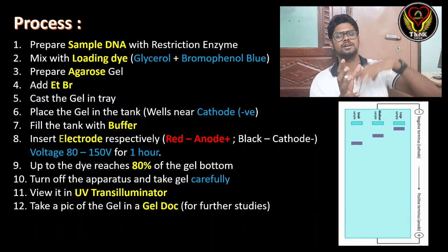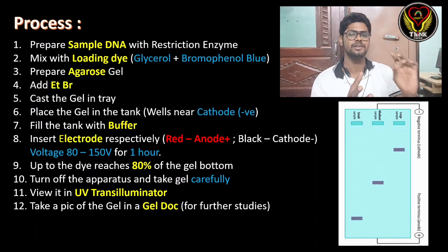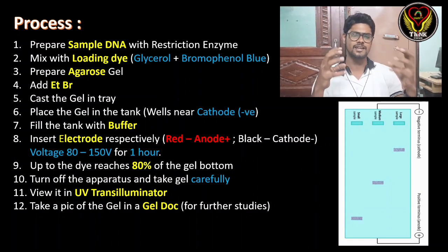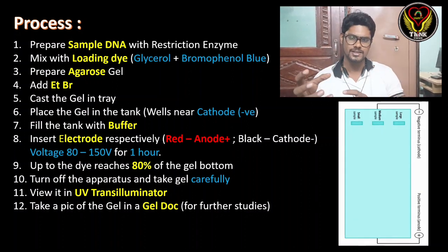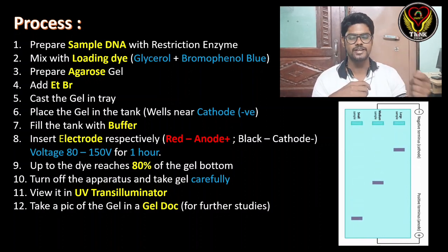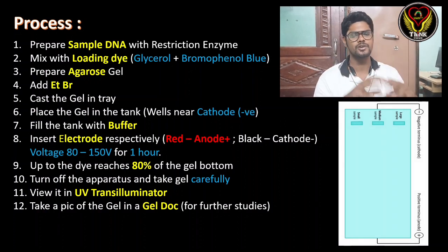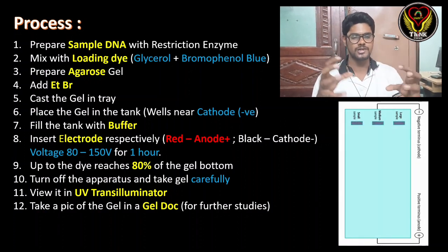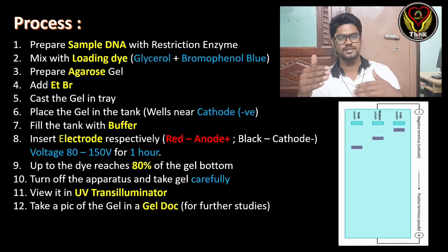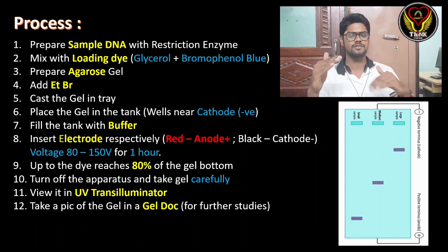Now we pour our TAE or TBE buffer in the tank and insert the electrodes respectively. The red electrode is the anode, which is positively charged. The black electrode is the cathode, which is negatively charged. We apply around 80 volts to 150 volts for about 1 hour. This is an approximate timing; it will differ based on the separation. Run it until the dye reaches 80% of the gel bottom.